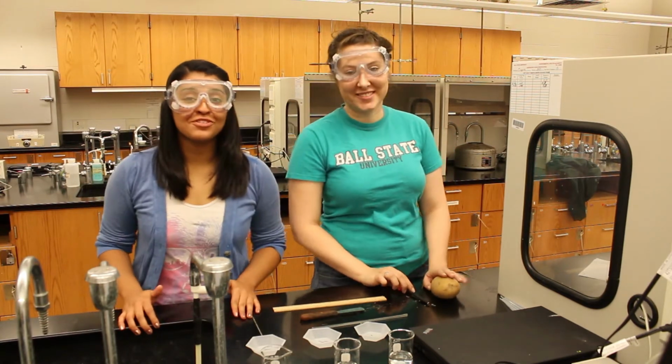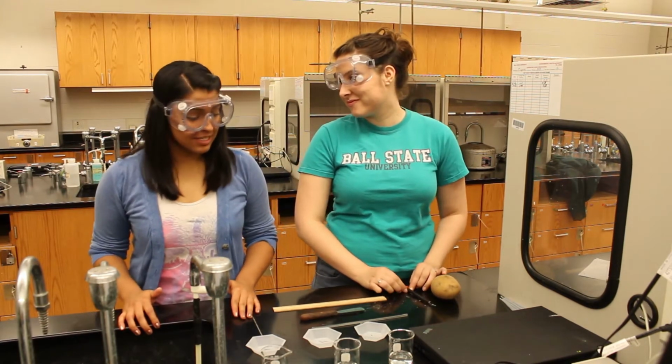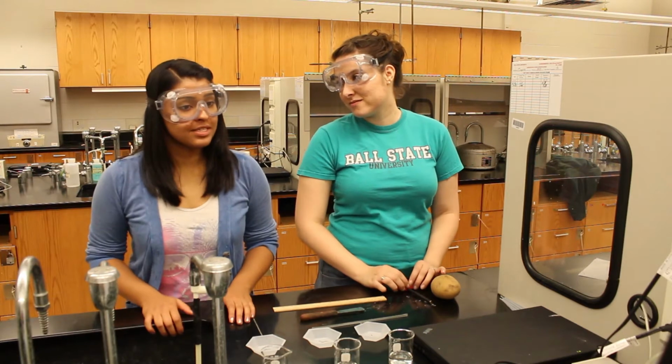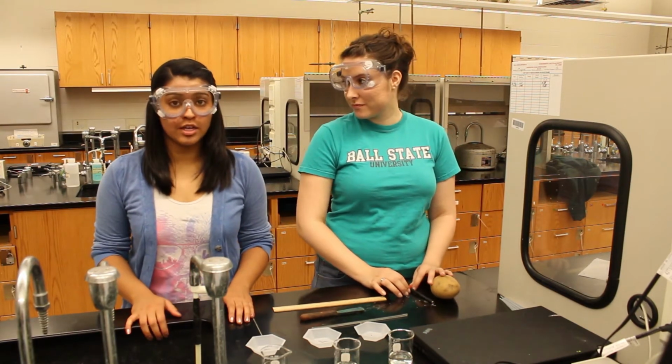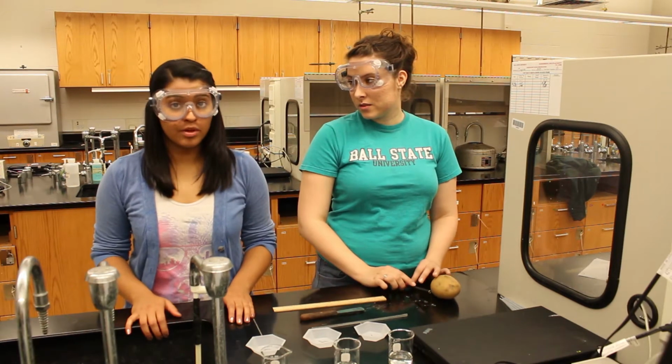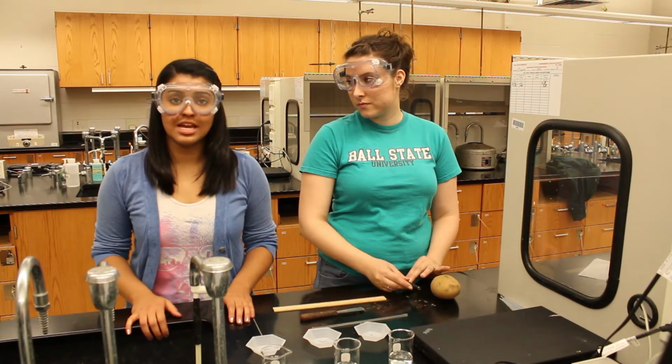Fine. In this first part of the experiment, we'll be investigating osmosis by placing potato pieces into three different solutions. One that is hypotonic in regard to potatoes, a second one that is hypertonic, and a third that is isotonic.